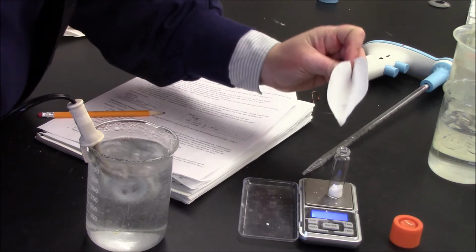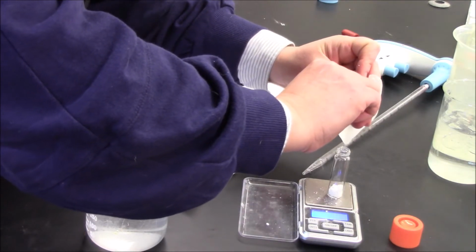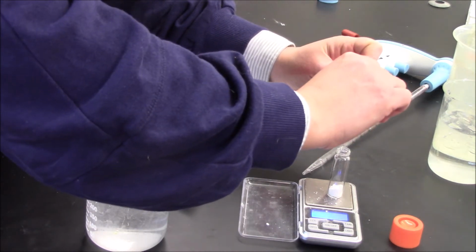Still not having much luck in terms of getting a measurable mass on my balance, so I continue to try to add as much of the crude product as I can.